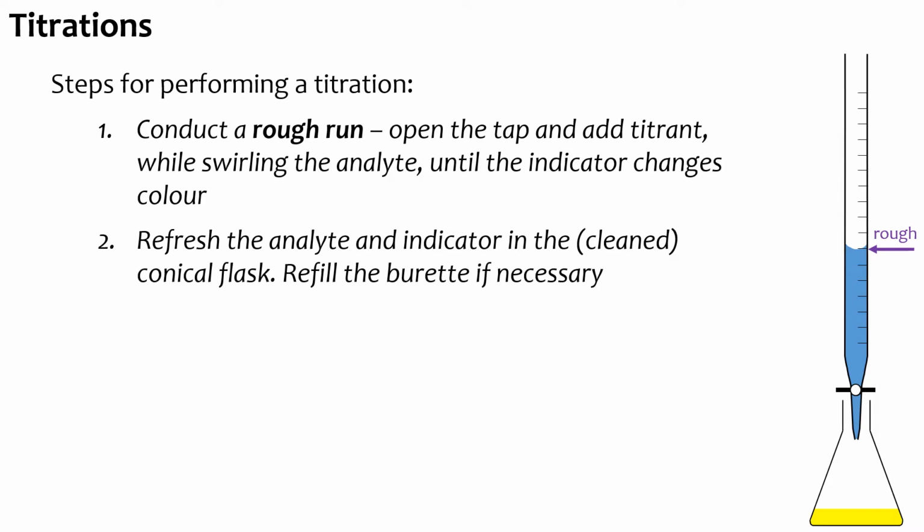Now, if we look at the burette that we've got just here, this has used, if we were to count this up, this is a very poor diagram, but that would be 10 centimeters cubed roughly. But if you look here, you've only got 6 centimeters cubed of solution left in the burette that's measurable. So we would need to refill the burette just here because there wouldn't be enough in the burette to do another run.